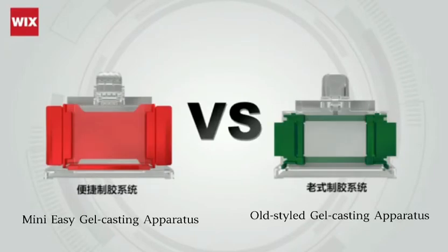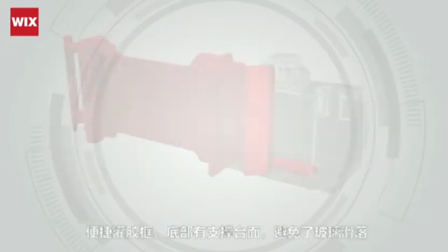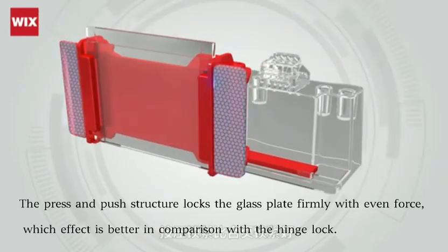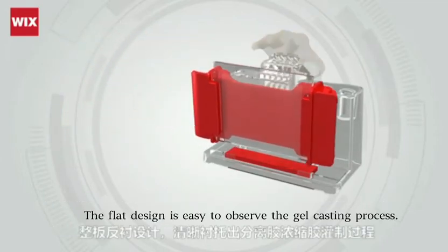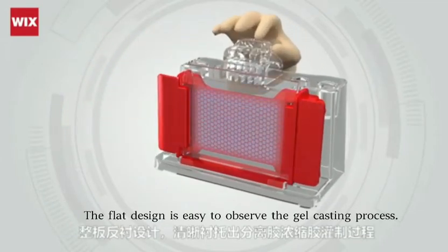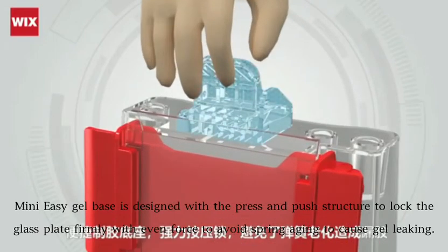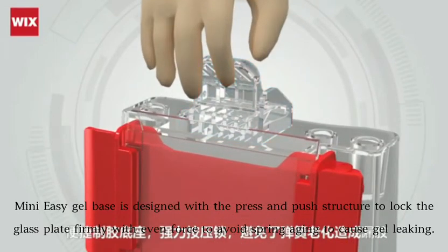The comparison between the easy and old-style gel casting systems. The support of the easy gel casting frame prevents the glass plate from falling down. The press-push structure locks the glass plate firmly. The flat design makes it easy to observe the gel casting process. With the press-push structure, the easy gel base locks the glass plate firmly to avoid spring aging and gel leak.